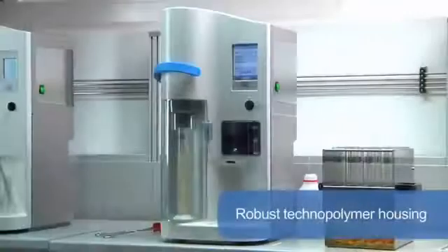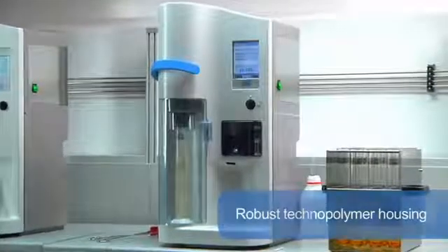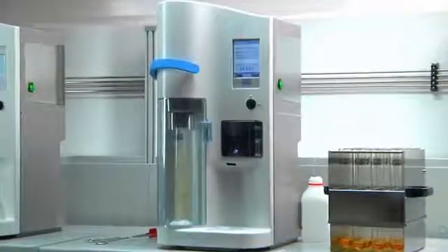The UDK 159 has been designed with a robust technopolymer housing for unprecedented resistance and a space-saving footprint. It is equipped with multiple devices to improve safety and convenience of use, including the exclusive safety lever, the protective door, and the service door.